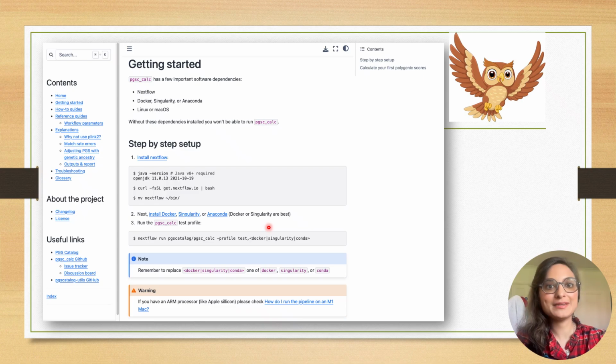And it's always recommended whenever you are trying out any new tool, hopefully they'll have some mini demo that you can work with, something simpler, just to make sure that it's working as it should, that there are no bugs. Hopefully. So this is just the first check, just to make sure that it's working properly for you so far. And then we're going to get more into the specifics. Yes, we will.